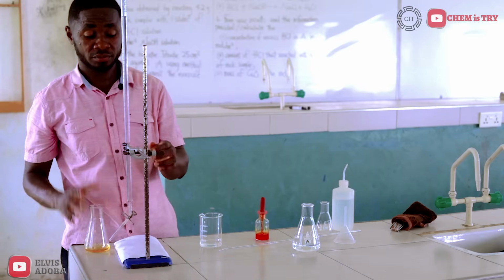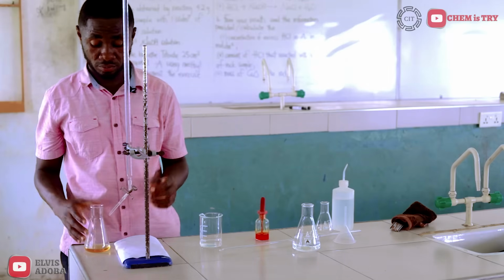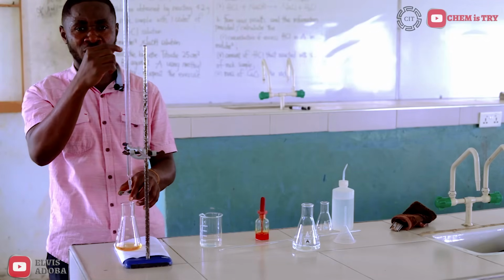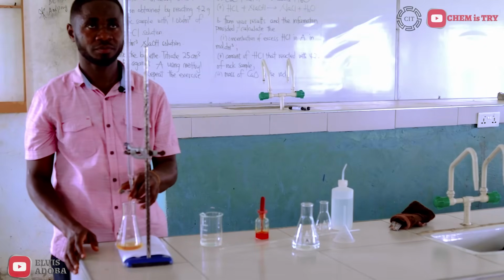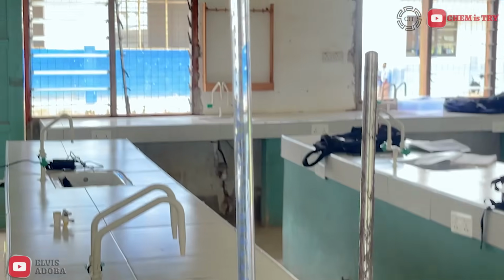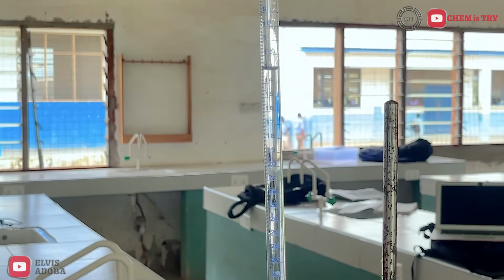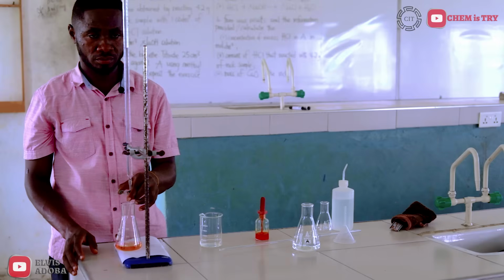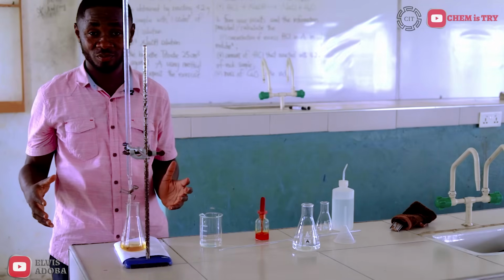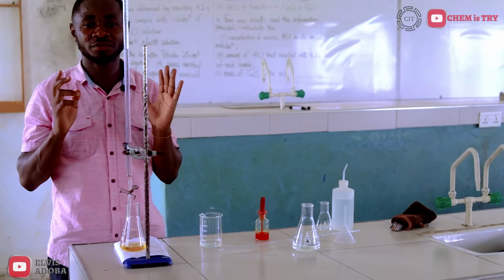My 2 drops. Then I release from 0 to around 16. Then I swirl. Then from here, I'll move dropwise as I continue to swirl.